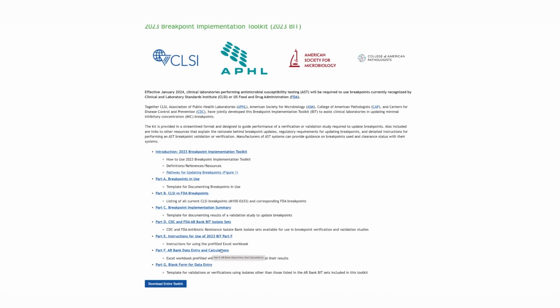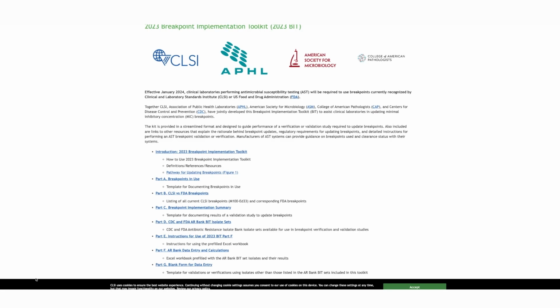So part F is an Excel workbook and it's macro enabled. However, none of the calculation formulas are based on macro functionality, and I'll go into details later about what those macros do. So depending on your operating system, I'm on a Mac right now.